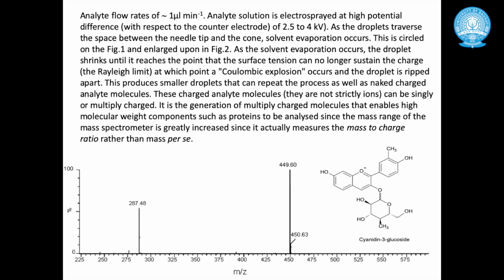Now if the MS system is not enough to identify a compound, in many cases it may happen, and even if we are 90% sure of the compound's identity, there is another 10% which needs to be confirmed. So the ultimate confirmation comes with NMR spectroscopy data.